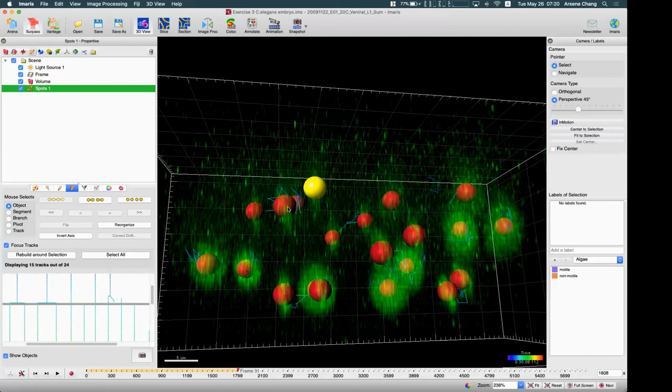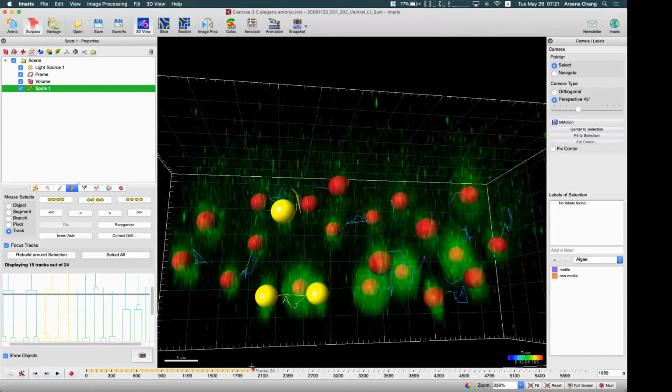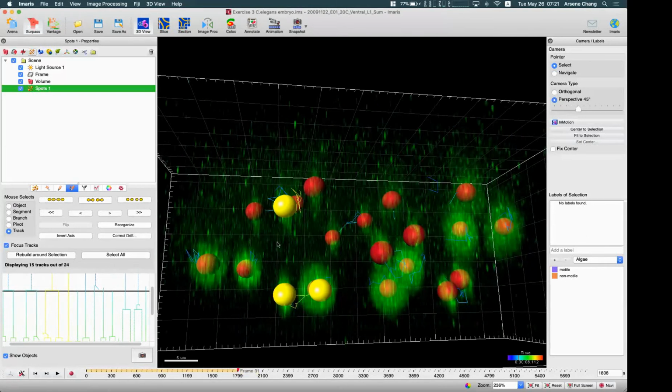Then from here, I can multi-select this object. And let me check if it's correctly selected. Let me try again. This track is this one and this one is this one. Right, so then let me go down. Okay, I guess I need to select this one first. Then I need to break it. Then maybe from this one and this one.